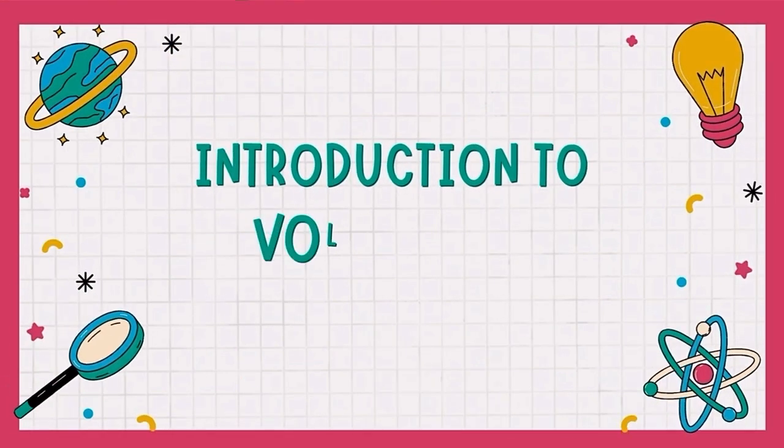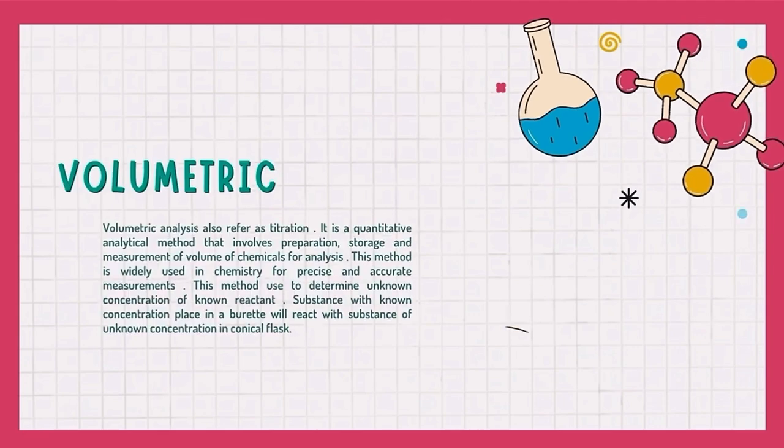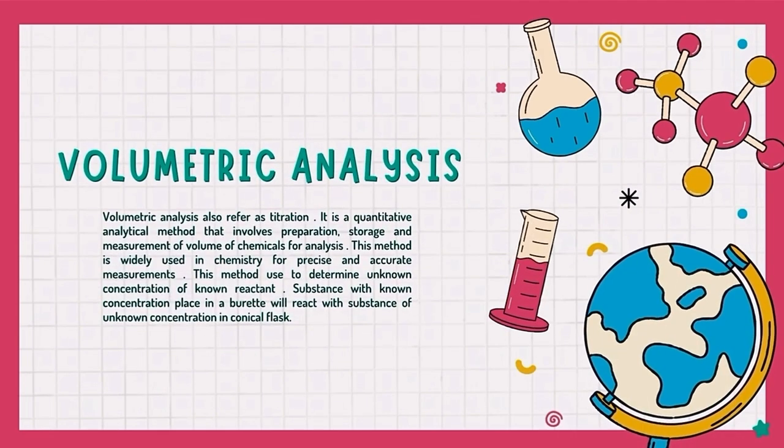First of all is introduction to volumetric analysis. Volumetric analysis is also referred to as titration. It is a quantitative analytical method that involves preparation, storage, and measurement of volume of chemicals for analysis. This method is widely used in chemistry for precise and accurate measurement.